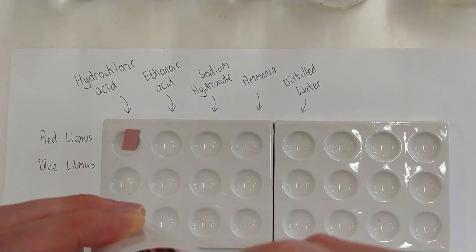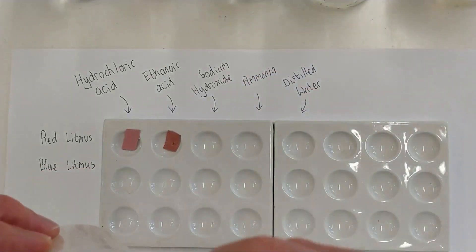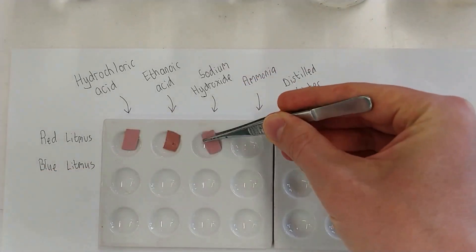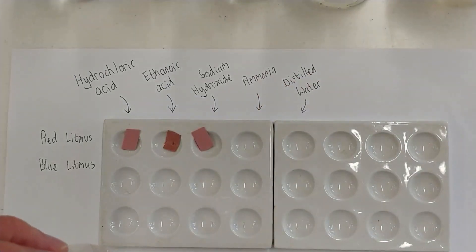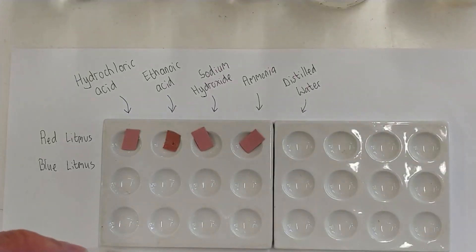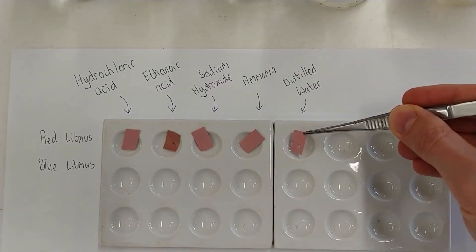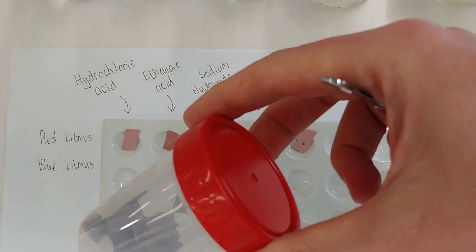And to do this, we're using our forceps because we don't want to touch the paper and get the chemicals on our hand or get all the skanky, horrible, rubbish junk like bogeys and poo that you have on your fingers onto the paper because that would contaminate it. Right, of course, that's true.